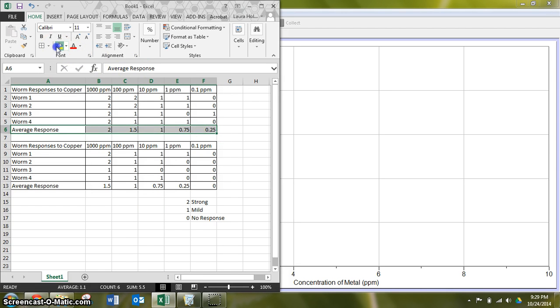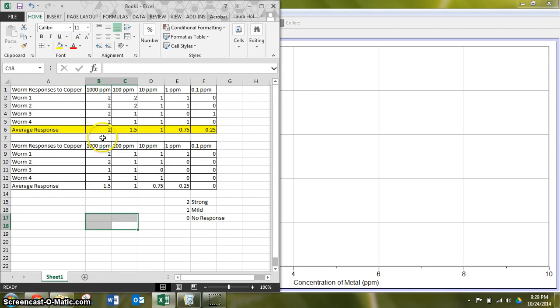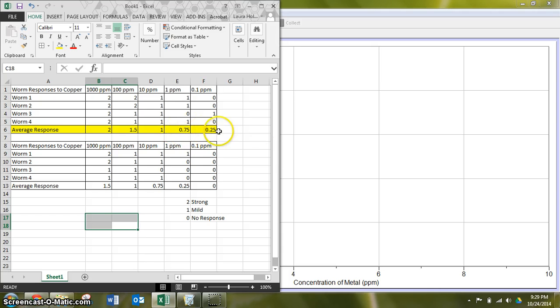So this is the group that we are looking at. I see that I have a response of 2, which is fully strong, 1.5, 1, 0.75, and 0.25 for these concentrations.